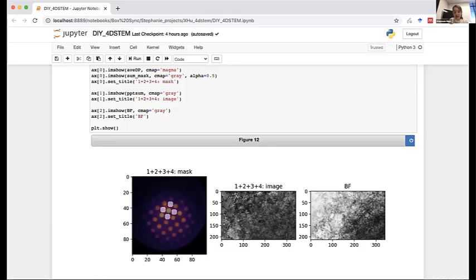So what I'd like to do is overlay these 2 images on top of each other to get a better idea of how these features interact. That's not possible with a traditional color map because as soon as you put one image on top of the other, you block out what's underneath. You can use this sort of transparency trick that I've been using so far, but as soon as you put one image on top of the other, you lose contrast for what's underneath.